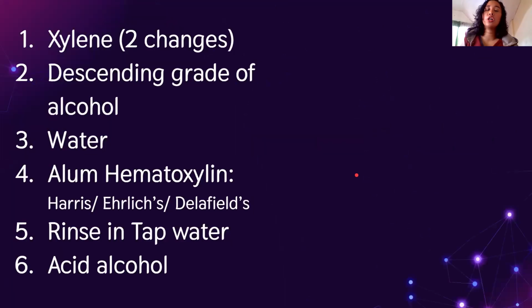So, steps on your H&E. Guys, each step is timed. The time is not that important as of now, usually 1 minute to 3 minutes. What's important is the rationale behind those steps. Class, here we have 12 steps in all, okay? So medyo marami, but it's only short.